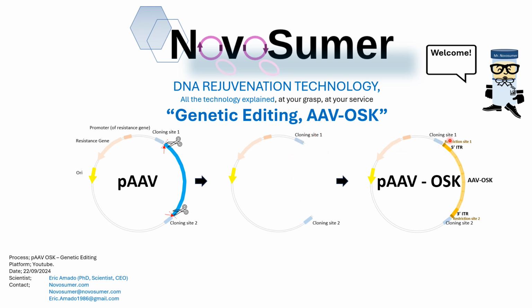And afterwards, what we're going to do is introducing a sequence, which is just copy pasting. Okay, we have the sequence for the genes of interest that we want to express. In this case, OSK. Remember, OSK are the genes that will let us revert the DNA age. So we will revert the age of the DNA using these genes, okay? So we will have the sequence of these genes and we will just copy paste here this sequence. I'm going to show you how, okay? Let's go for it.